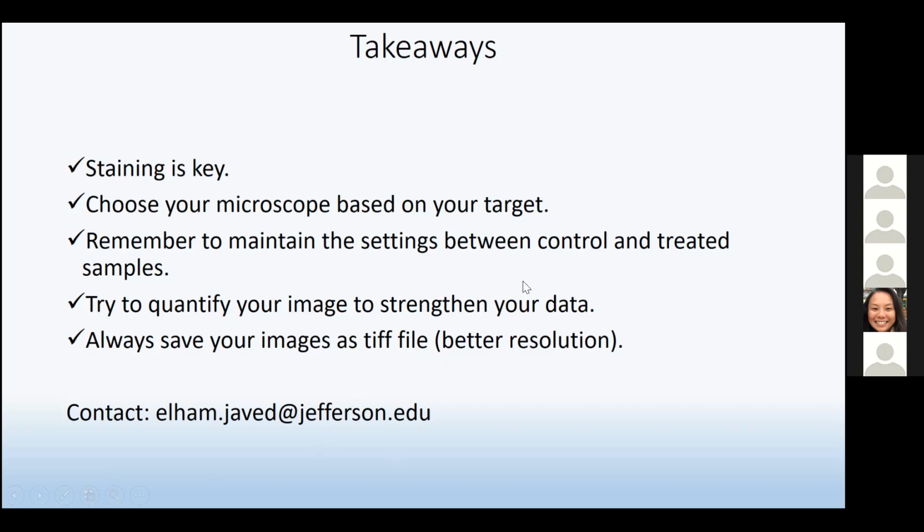Unless your data is something like a black and white image where you have no staining in one sample and it's lit up like a Christmas tree in the other sample, you don't really need to back it up with quantification. However, if there is a slight 1, 2, or 3-fold change difference, it's always good to quantify your data by some means.